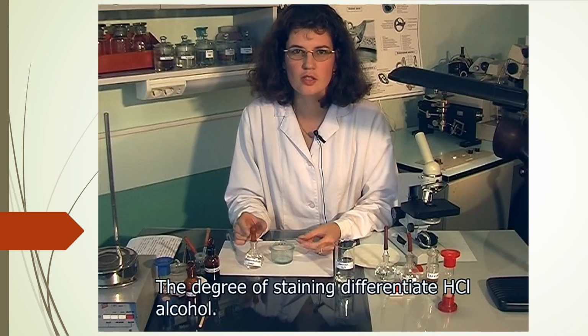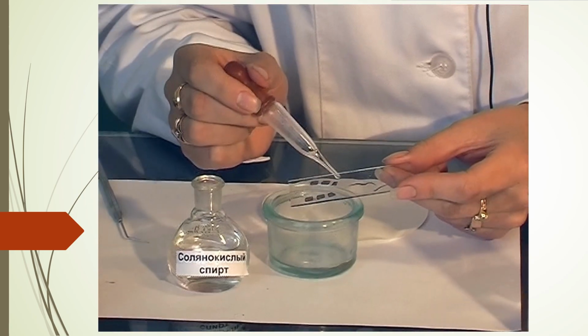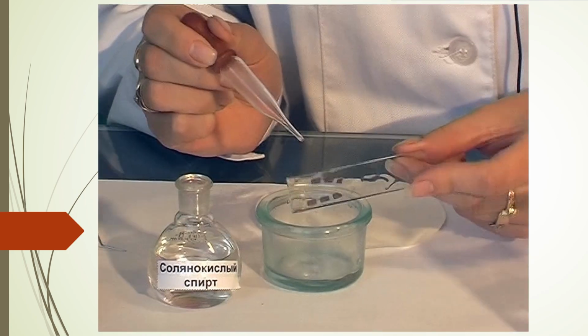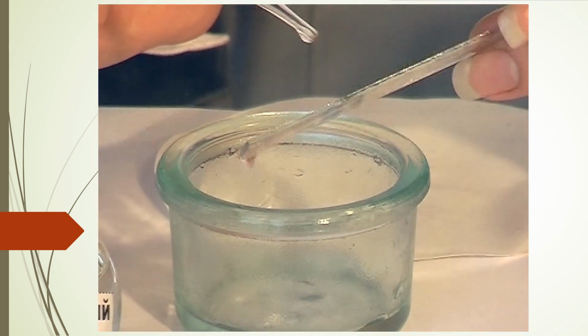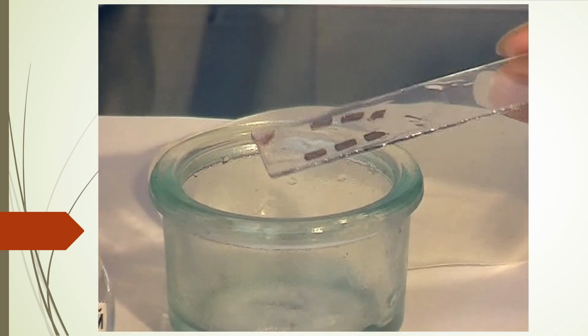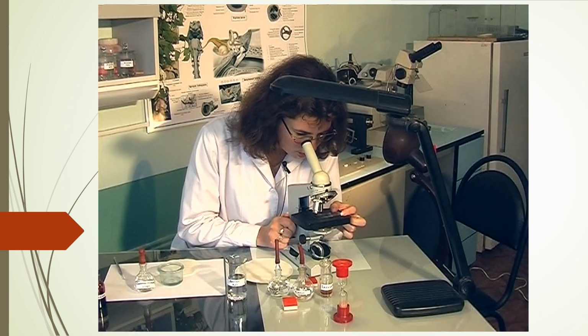To differentiate the degree of staining, we use hydrochloric acid ethanol for a few seconds, and control under the microscope.